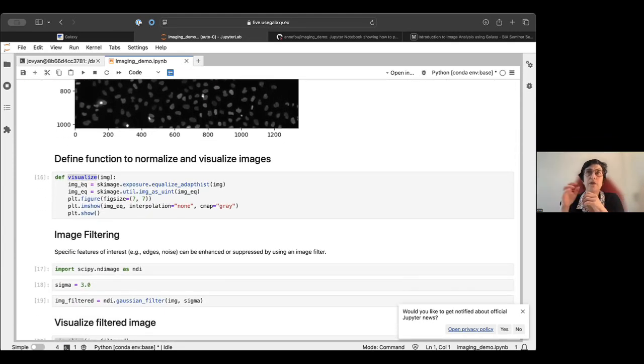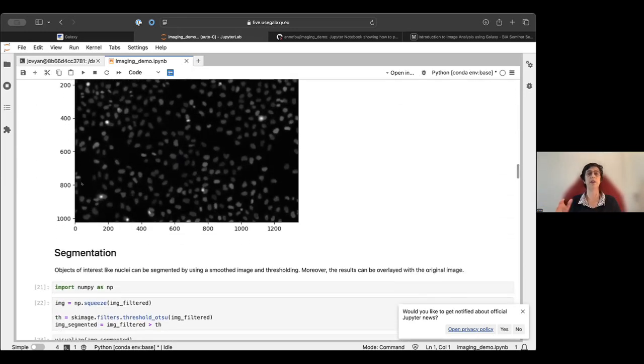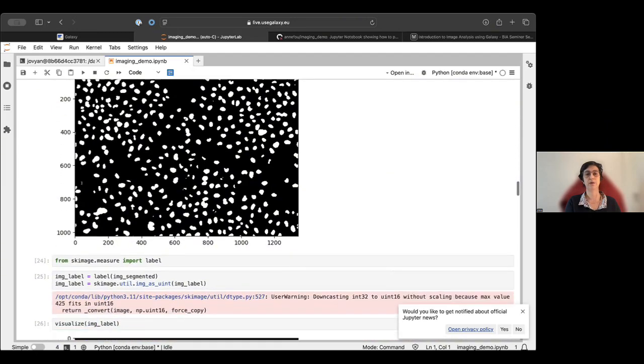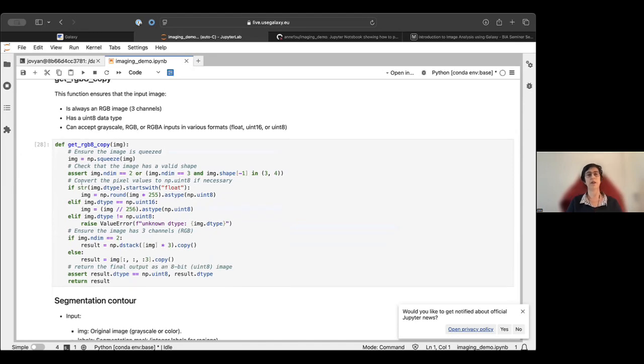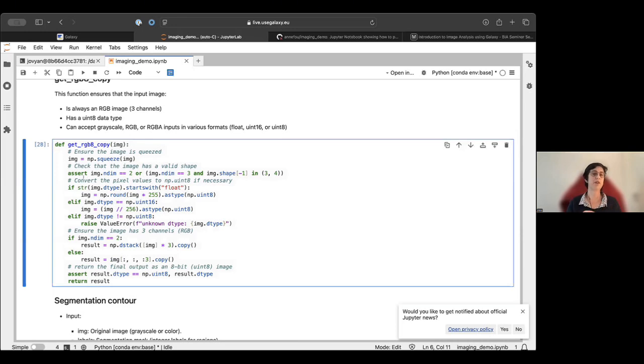image. And with some functions, sometimes you want to have an RGB image. So what you want to do, especially when you think about automating and making a function that is reusable by many other users, you want to make, for instance, a function that could take different types of images and will make this image usable for the next function. So for instance, here, many of the functions need an RGB image, but sometimes you don't have an RGB image. Here we have only one image, which is a 2D image, and what we are doing is copying the same into the R and G and B. So then you can use different algorithms.